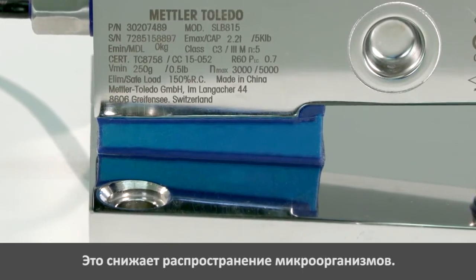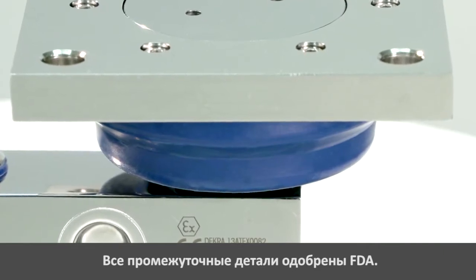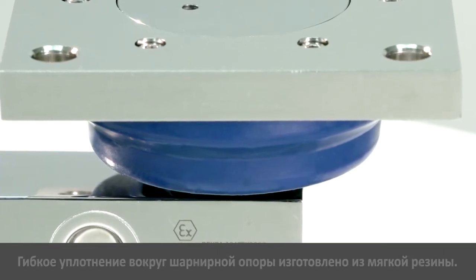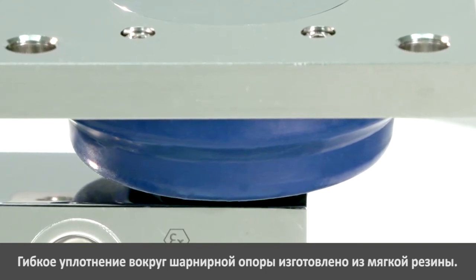All intermediate parts are made of FDA approved polymers. The flexible gasket with rocker pin inside is made of soft rubber to allow movement for thermal expansion and contraction, preserving accuracy.